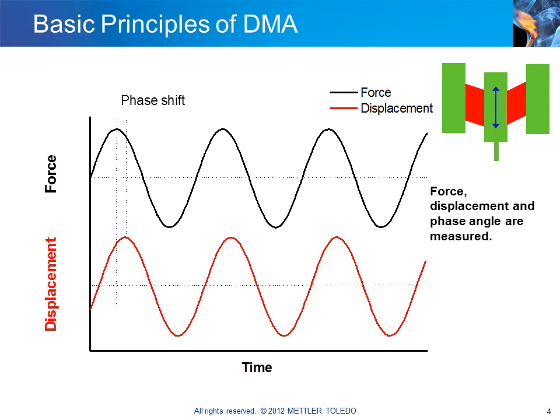The sample is subjected to a periodically changing force and undergoes deformation at the same frequency. The magnitude of the deformation is small and is within the linear elastic range of the sample. Typical of viscoelastic behavior is that the deformation lags behind the applied force. This produces a so-called phase shift. The left part of the diagram shows the curves of the force and displacement amplitude and illustrates the phase shift.